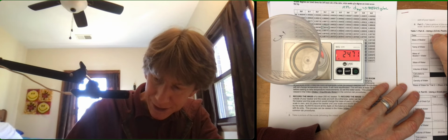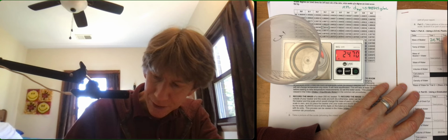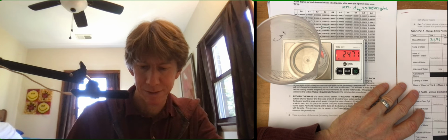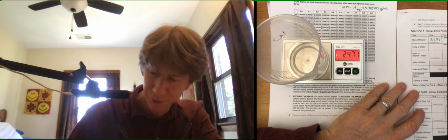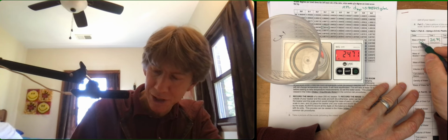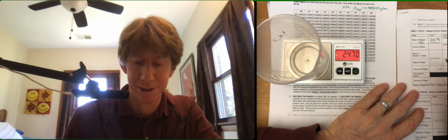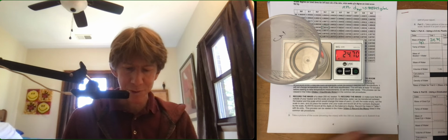I'm going to write that right here under mass of beaker trial 1, 24.71, and I'm going to put my units here. If I put G for grams here, that means that anything across here is going to have the same set of units. My temperature of my water.